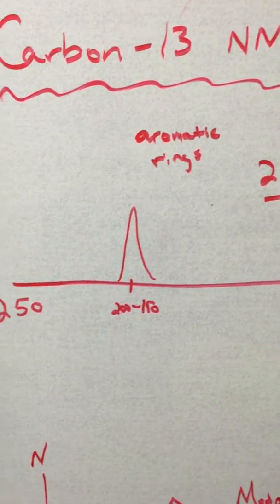So in conclusion, this is our hydrogen NMR, carbon NMR, and mass spectrometry for modafinil.